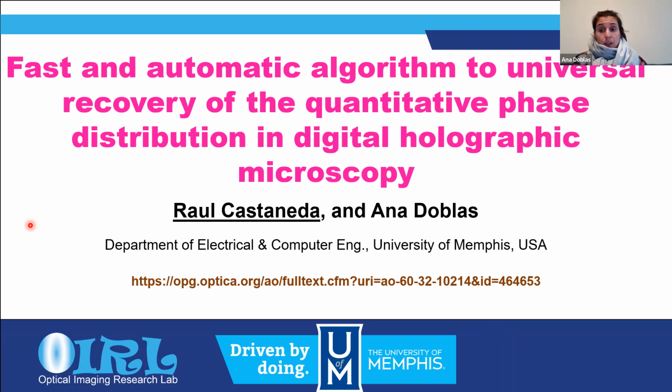The video that I would like to present to you is one of our latest works. It's about an automatic algorithm to reconstruct quantitative phase images in digital holographic microscopes. This work has been recently published in Applied Optics, and it has been chosen as an editor pick.